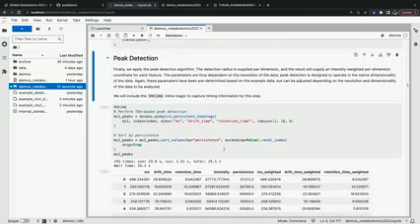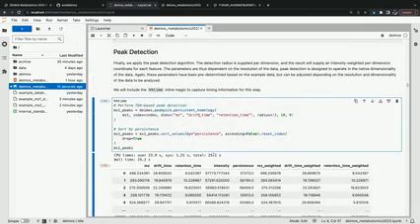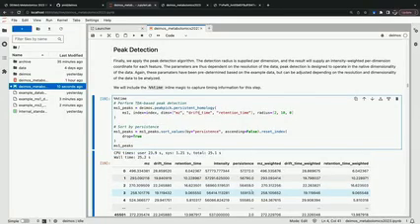And then now that we have our data smoothed, we perform peak detection. Peak detection performs peak picking per dimension, and you supply parameters per dimension for that purpose. So you see in the radius parameter, you can specify the peak detection radius per corresponding dimension.